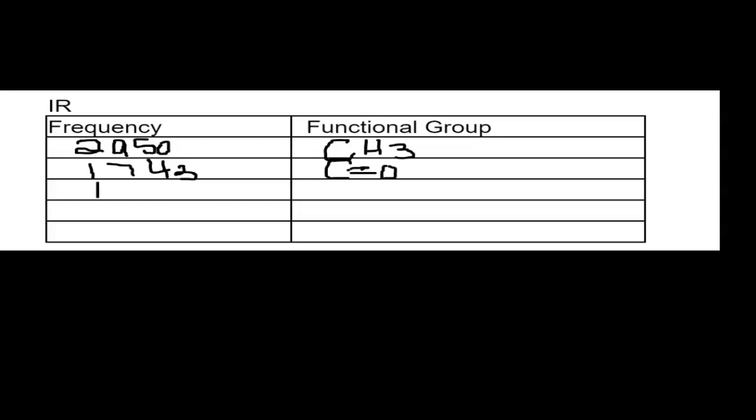Next we have 1,185, and that will be the carbon that is single bonded to the second oxygen. And then we have another CH2. Then we have a CH3.